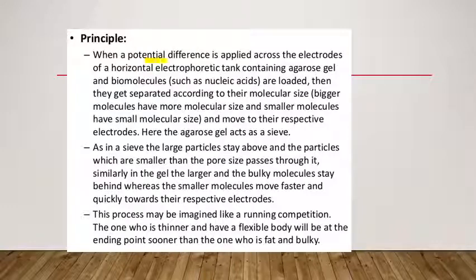So when a potential difference is applied across the electrodes of the electrophoretic tank, as we have said, electrophoresis is carried out in two ways.